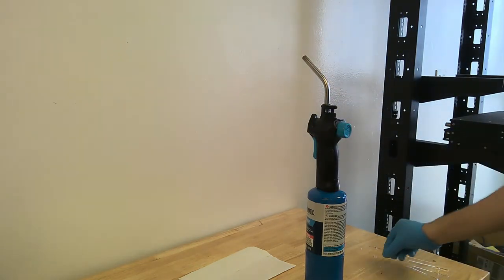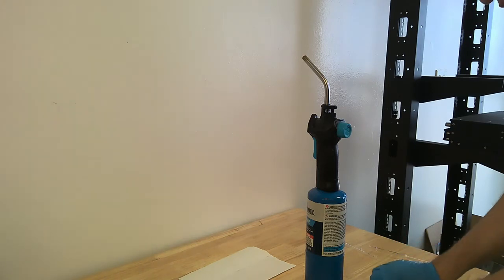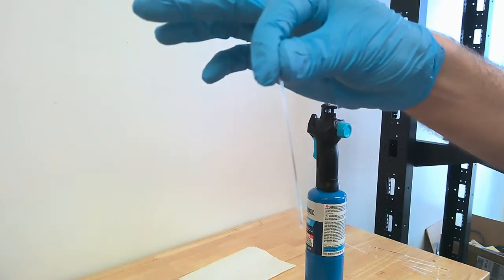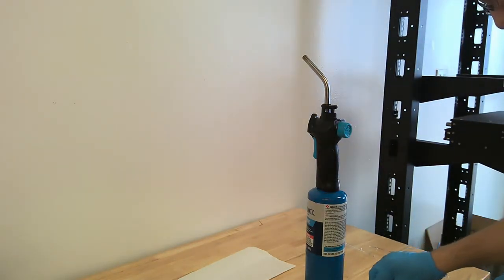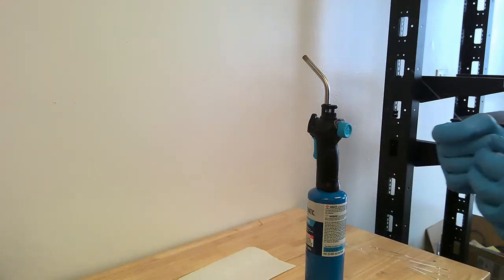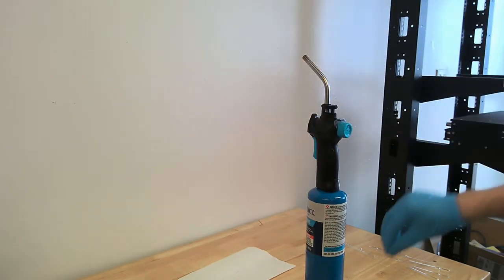So, common pieces of glassware that we're able to prepare in the organic chemistry laboratory for our use, first and foremost, are melting point and boiling point capillary tubes. You can prepare these rather than buying them commercially. We can also prepare microcapillary bells, which are small pieces of glassware designed to go inside the capillary tube. We'll show you a close-up of that later on in today's experiment. You can also prepare spotters for TLC and other sampling of your organic reactions.